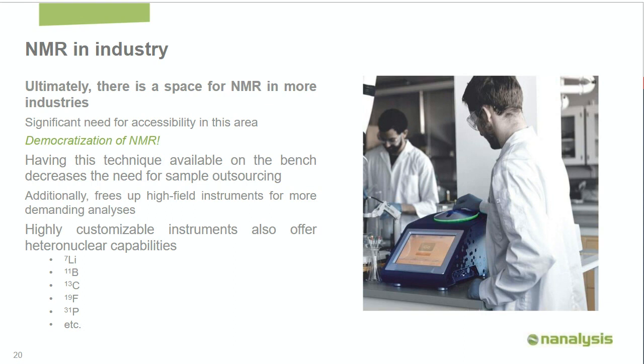So these high field instruments are crucial to certain areas of research because of their incredible sensitivity and resolution. But many analyses simply don't require these. So we need to free up these instruments for the analyses that do require them. So finally, just a really quick comment to mention that these benchtop instruments are highly customizable, so they can be tailored to accommodate a wide variety of heteronuclear experiments, which can feature nuclei such as lithium, boron, carbon, fluorine, phosphorus, and others.